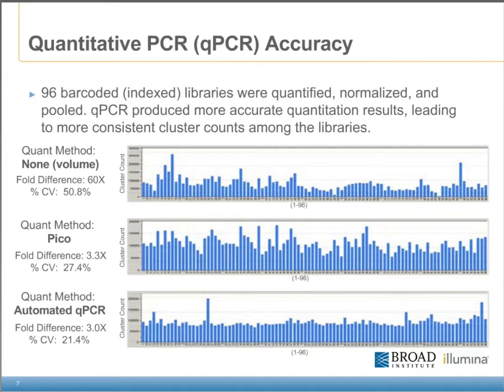First, the libraries were normalized and pooled based on the quants given by the Agilent Bioanalyzer. This was almost like loading the libraries blindly onto a flow cell. As we expected, the cluster counts were low and very inconsistent. We then used a pico-green assay for quantification. This produced cluster counts that were much higher; however, there was a lot of inconsistency, because pico-green quantifies all DNA fragments in the sample, not just the fragments that are going to amplify on the flow cell. Finally, we used our automated qPCR quant result to pool the libraries. This method gave us some of the most consistent results. There were a few outliers, but overall the number of clusters coming from each library was very consistent.